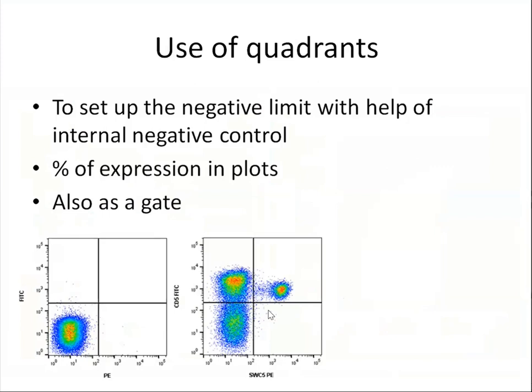Any doubts with scaling? There are 2 chat box questions. Sir, in a density plot, do different colors represent different populations? No. In a density plot, different colors represent the concentration.